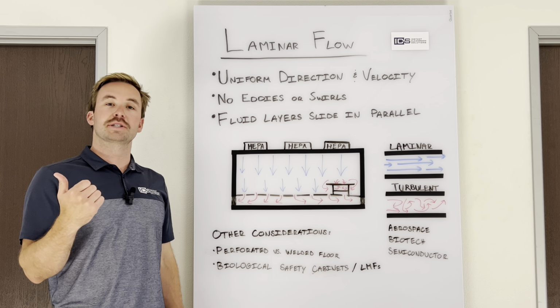And with this, we have a perforated floor, and so the air is going through the floor. It's a raised floor. This is an example of a raised floor tile. This is a 2x2 tile right here. And you can see a lot of perforation, a lot of room for air to flow through this. And it really helps clean rooms breathe. However, the challenge with this is it's really hard to clean. And so it's not the best for certain industries and certain applications.